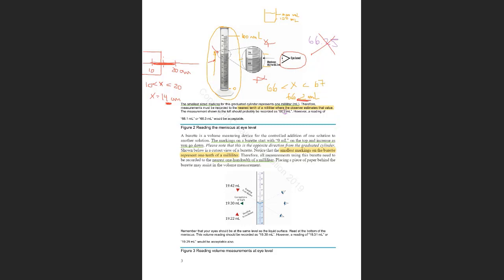And the second consideration is that when you put a liquid inside the graduated cylinder, there is interaction between the liquid and the glassware. So the liquid, instead of being just straight, makes a little interaction with the walls of the cylinder, and this is called meniscus. So if you are in the lab and you say, oh, I have to read a correct volume, where do I look?